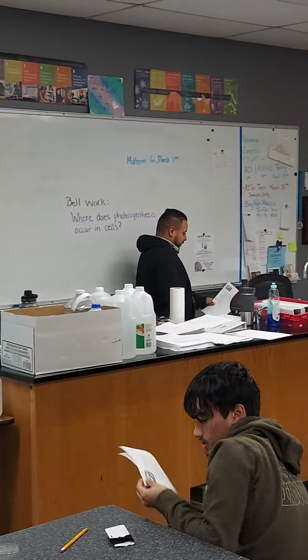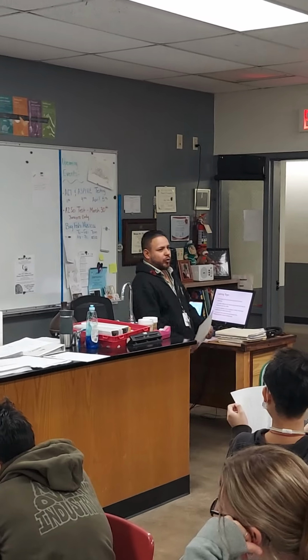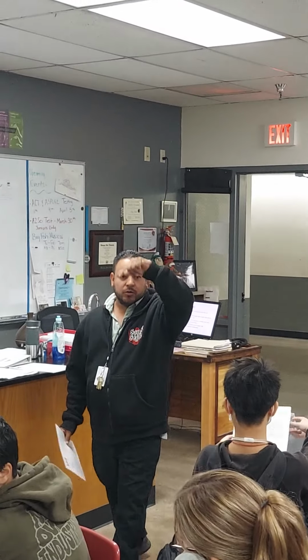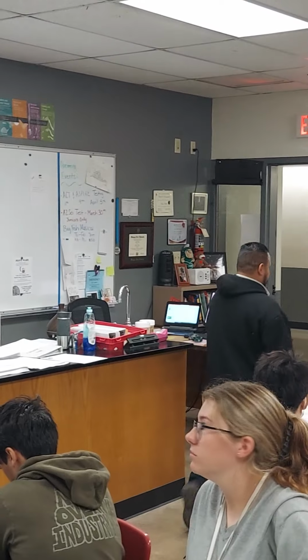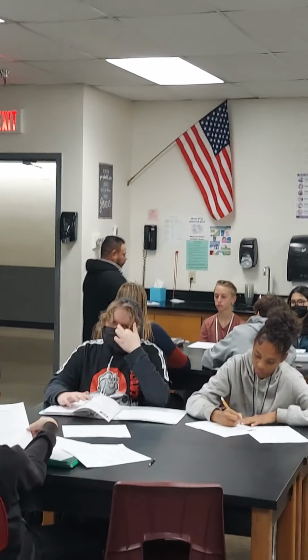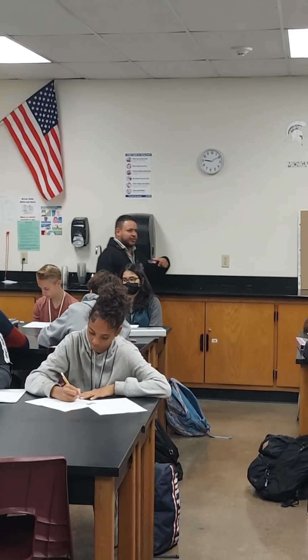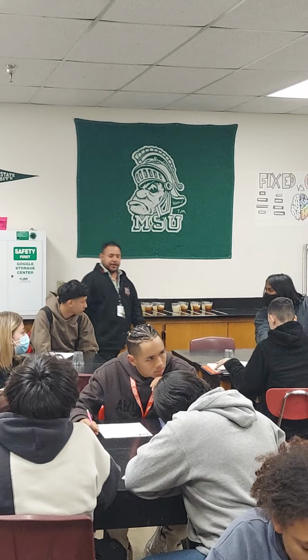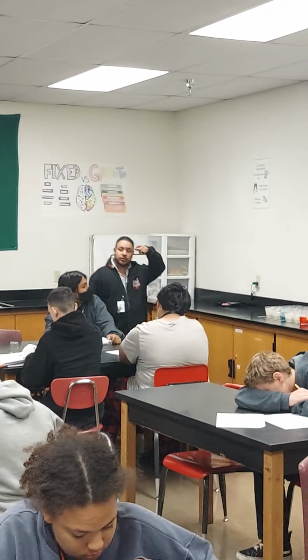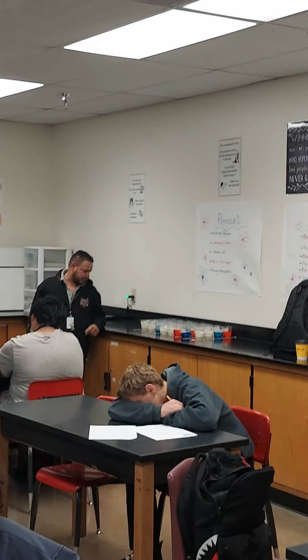So with part one, we're gonna be working on cups 1 and 2. Each table, one by one, you're just gonna get up and get cups 1 and 2, and go back over there, okay? The reason we're gonna go over it is just to see the pH balance of the water and how it affected the egg. So table 1, go get your 2 cups.